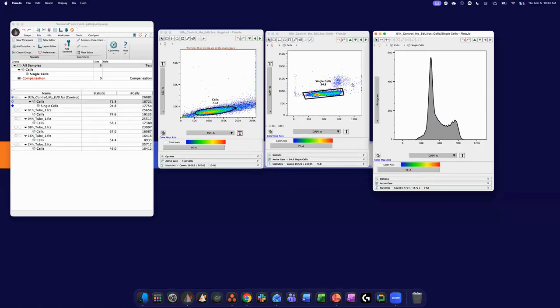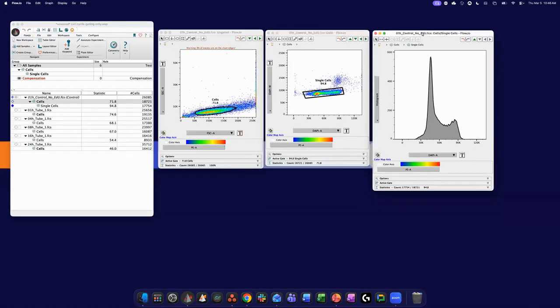So I would imagine we'd still want to capture cells with a proportional ratio for that, because here we're basically saying it's okay if the DNA content goes up, but that doesn't mean the cell should take longer to pass through the interrogation point. So I imagine your cleanup gates, the two on the left here, are going to be largely the same. Maybe you'll have some larger complex cells off the forward scatter, so your forward scatter gate might need to be a little bit bigger. But I do think the doublet exclusion is probably going to be largely the same. Unfortunately, I don't have any data to really show that right now.